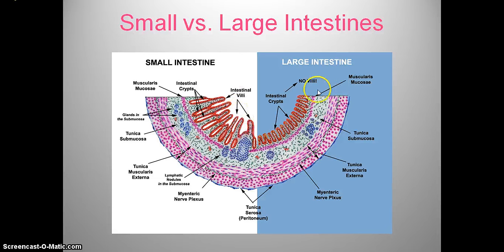We have, these are tissues, so notice how we have different kinds of layers of cells. The ones which we looked at and I pointed to are right here. Then underneath we have cells which have glands or secrete substances into ducts, almost like they form walls of little vessels with little hoses secreting different enzymes.